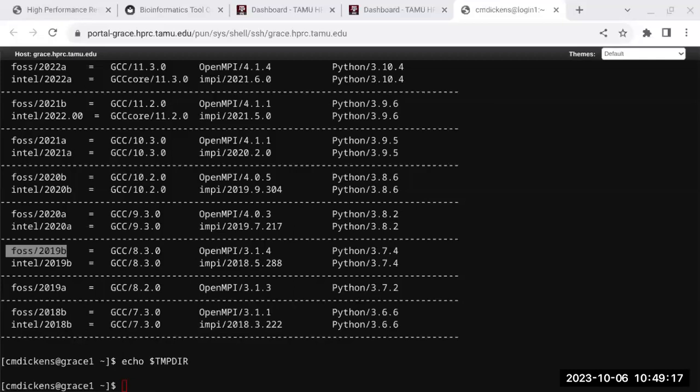If you don't need those files when the processing is done, this is the best approach. Just write to the temp directory, create those 500,000 files, and delete them. If you try to write 500,000 files to scratch, it could take longer, but also you may reach your quota and your job fails in the middle. Then you've got to request a quota increase. It might take a day or two to get approved. And then you've got to go back and start over. Okay. So take advantage of that temp directory.